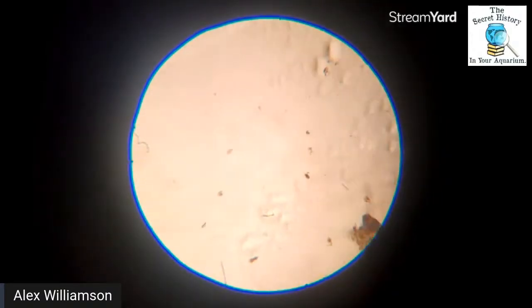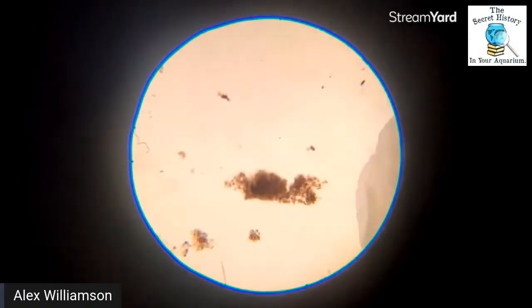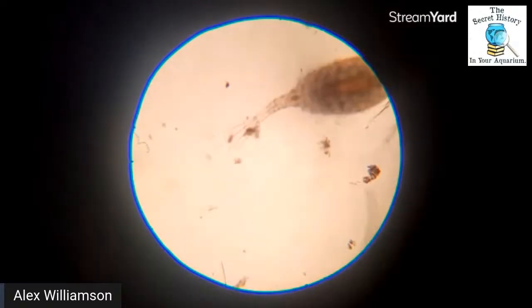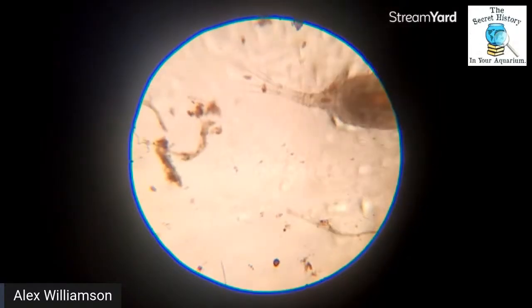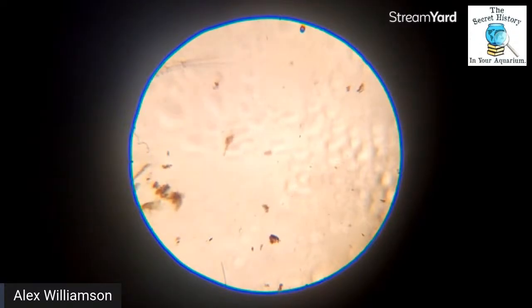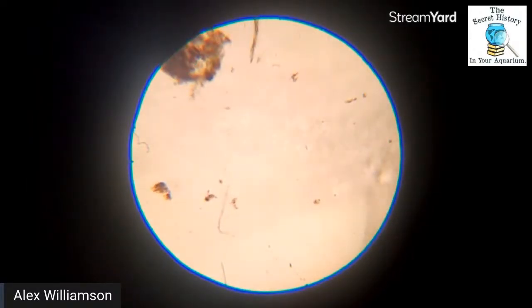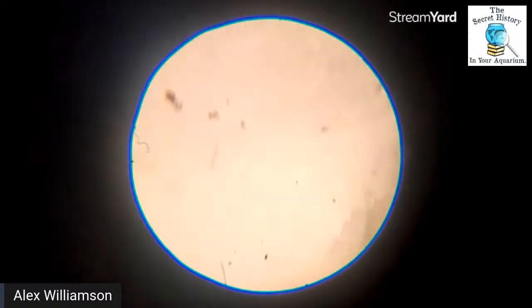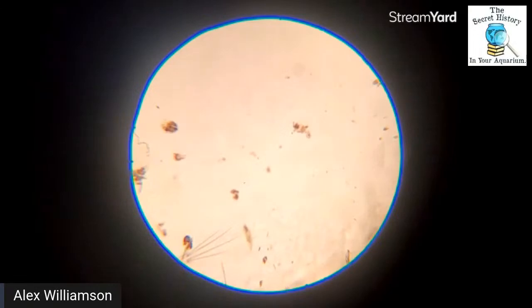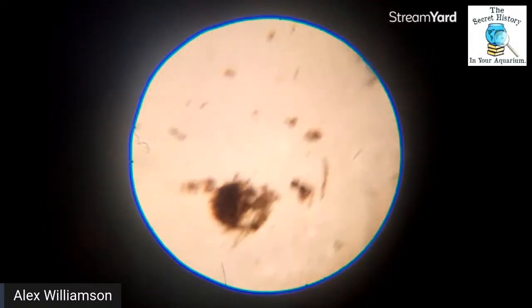Come on. Now he's like a fish on the beach. See, he really doesn't like the light. That's also why this is a 1980s microscope, and they still do their job just fine, which is great and all. But the heat and the light that they produce from having an incandescent bulb really does not please the little life forms. And so they spaz out, which does help you see them moving sometimes. Hey, we got a couple of them in here. There's two in here. Yeah, there's only 75 or so of us science-loving aqua nerds in here. Come on, stay in our slide. Slip sliding away.